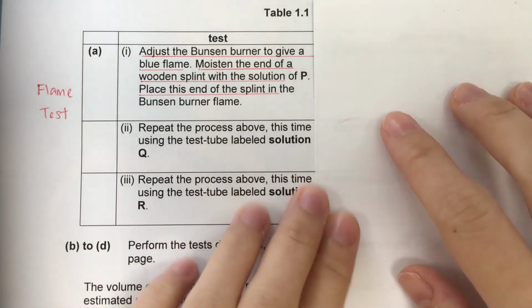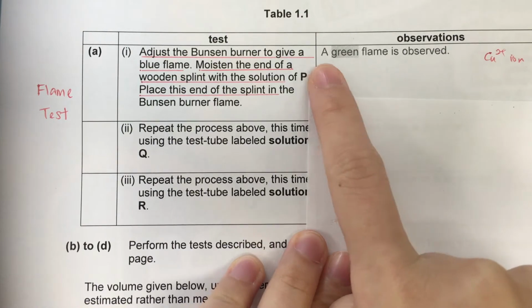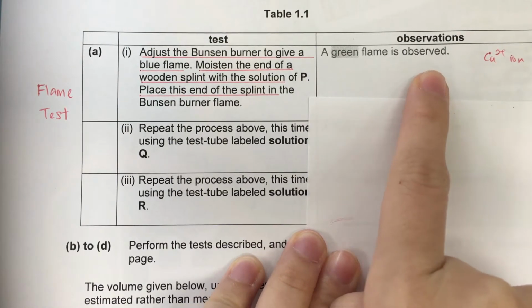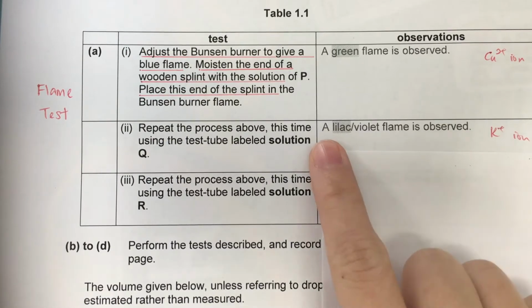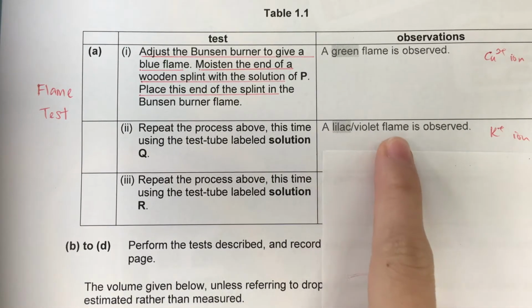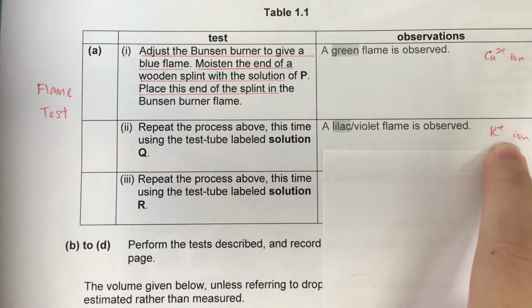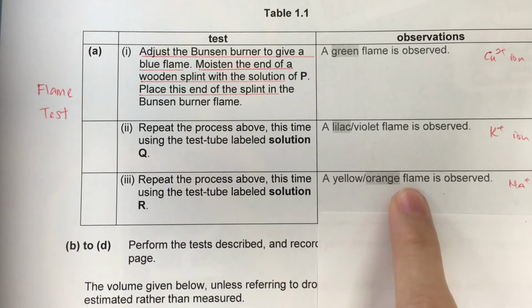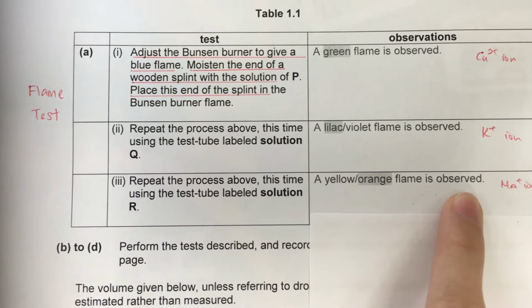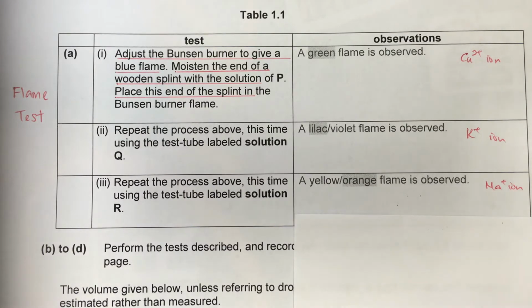So flame test means you want to see the color of the flame. So you have to describe it as green. A green flame is observed, and green will tell you it's a copper 2 ion. Lilac or violet flame is observed. This will tell you it's potassium ion. So from this flame test, we can tell which cation it is. And if a yellow or orange flame is observed, it is sodium ion. When you do flame test, you always expect to see a color.